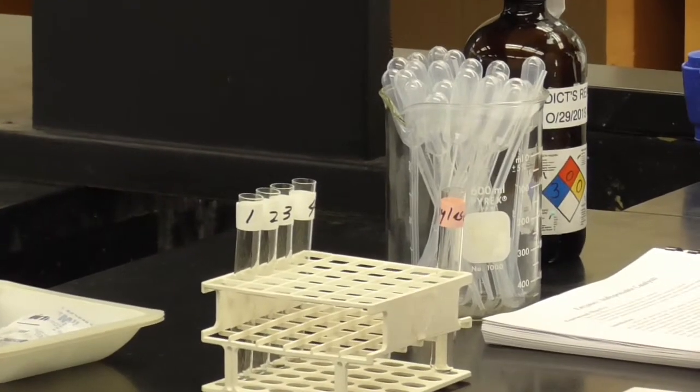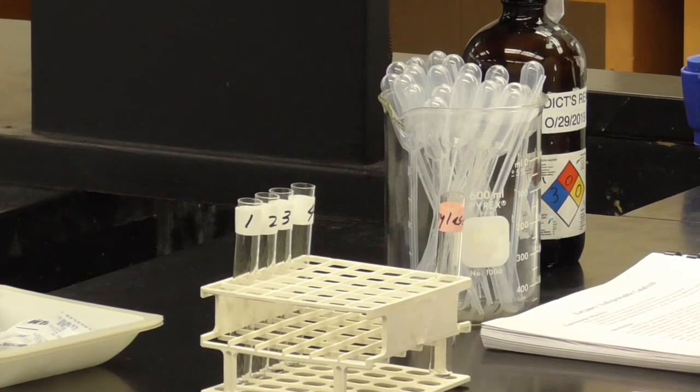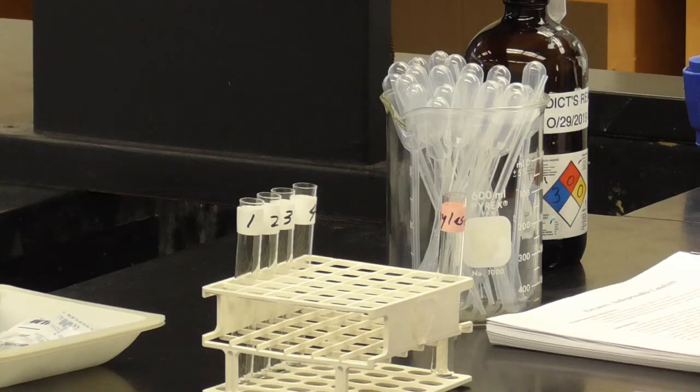I mean, maybe it's such that just a little bit of enzyme is all it takes and you max it out immediately, or maybe it will increase as you add more enzyme. I don't know. We're going to find out. All right, so the effect of concentration of enzyme, how much enzyme is present. Let's go through the procedure.